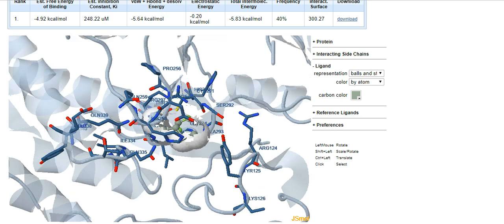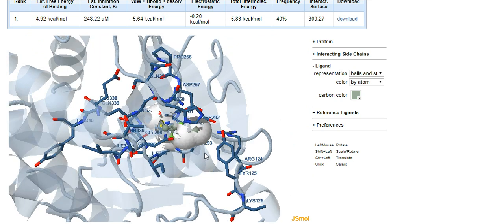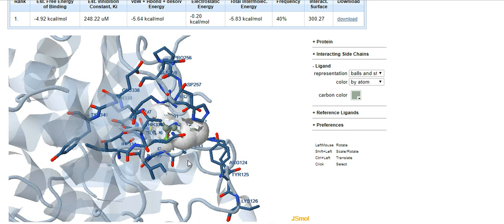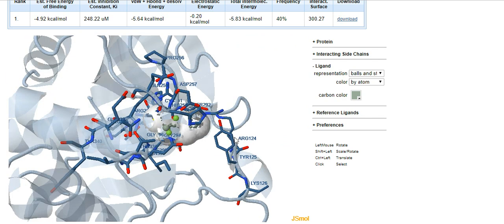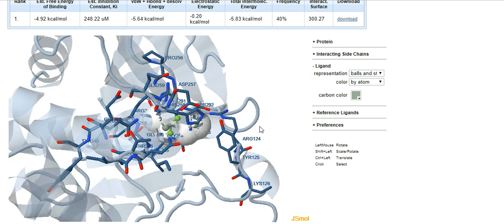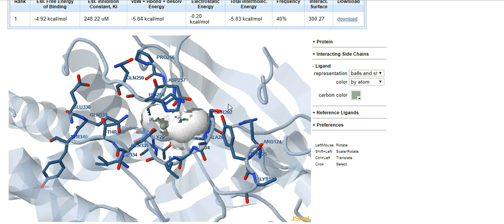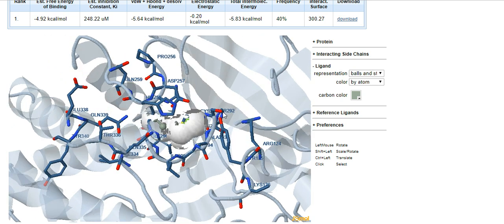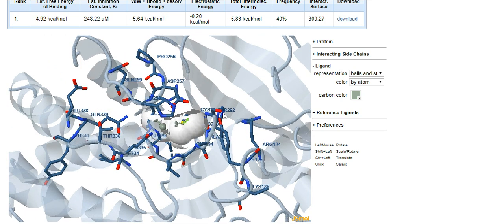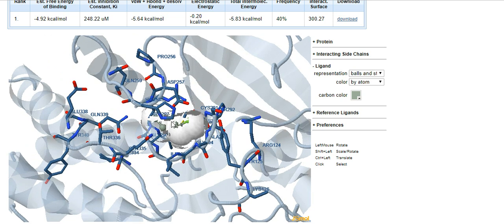And because it's not particularly easy to do, this is looking quite hopeful. Yeah, I like the look of this. You can see how that is nesting quite nicely in the active site. That would be a screenshot for me, I think. I quite like the look of that. Looks like a sulfur in there, so it's going to be a cysteine, isn't it? Yep, there it is, look.